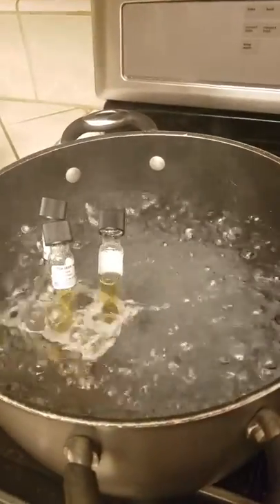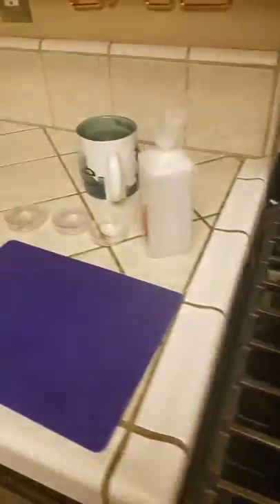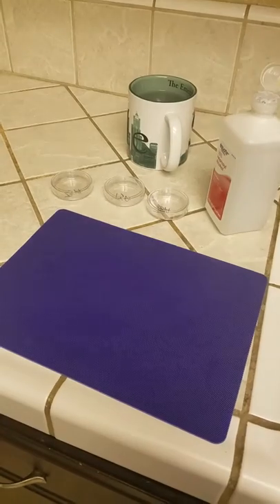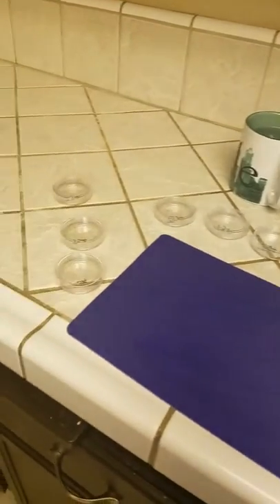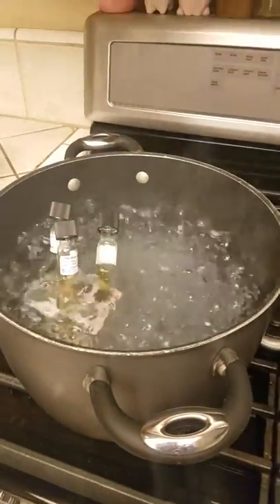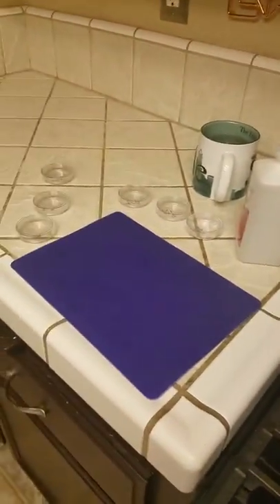So my agar is about completely melted, so I'm getting ready. I have my work pad here already cleaned off with the alcohol, my cup of hot water, my petri dishes, and I'm getting ready to take the agar out of the boiling water, get it into the cup of water, and into those plates.